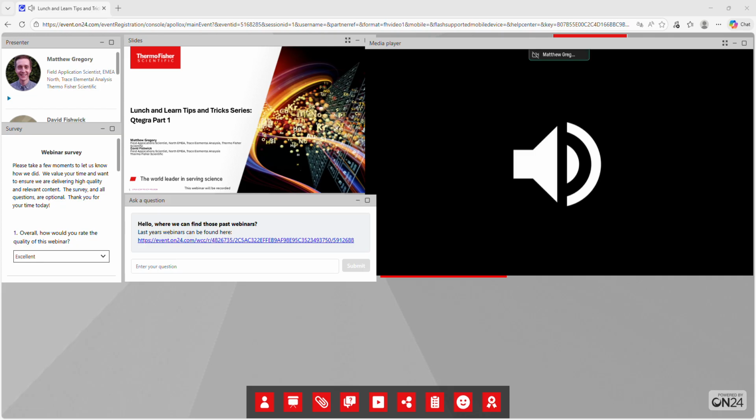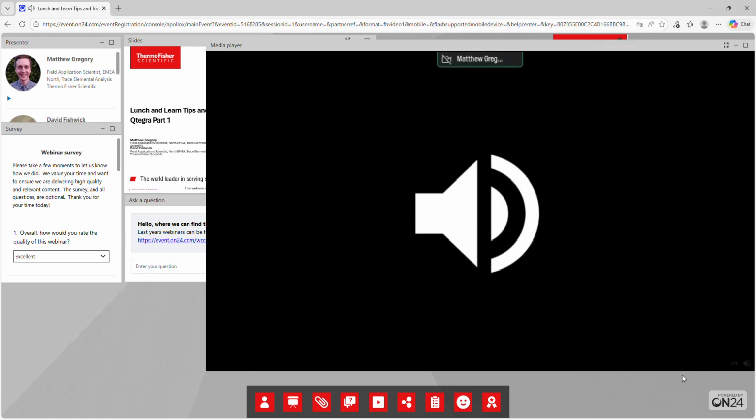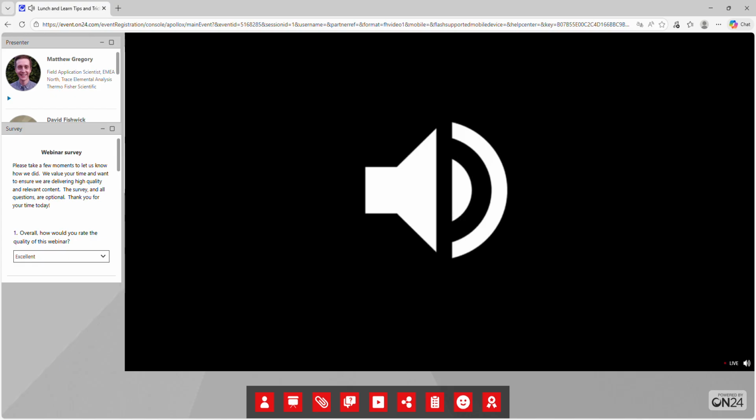So if we're setting up another lab book using the same mode or tune set and the same wavelength, we don't need to auto peak that wavelength. If we're using a new wavelength, or it's the first time we've used that wavelength using that tune set, then yes, we can auto peak it, but outside of that, we don't need to. So in a way, it should be a bit more efficient than the ICAP 7000, because every time you created a new lab book, you had to do the auto peak, whereas now, if you're using the same wavelength and the same mode, even if you create a new lab book, you don't need to do that auto peak. The information should be carried through because it's a global parameter now.